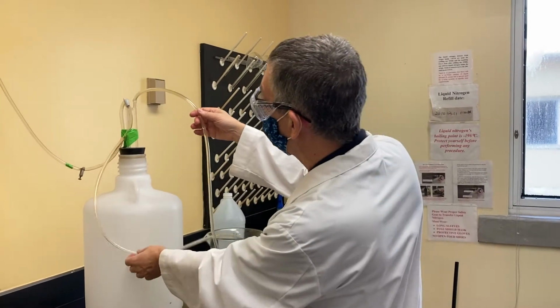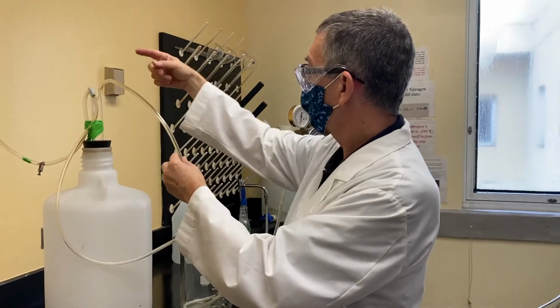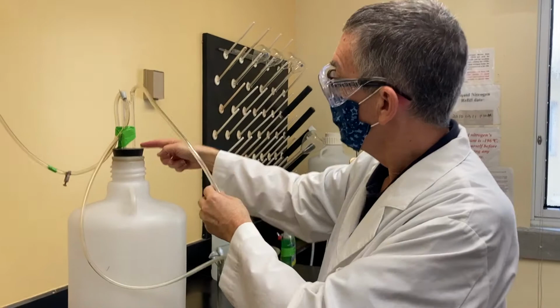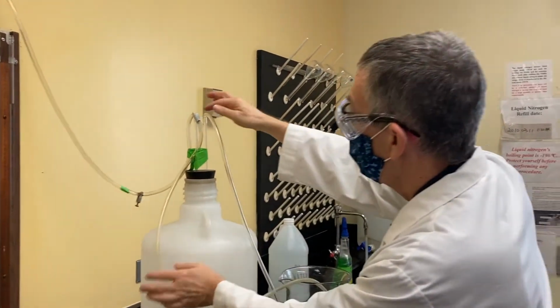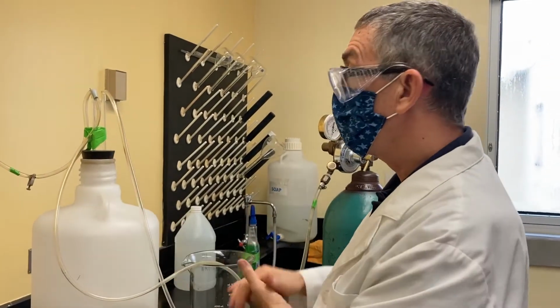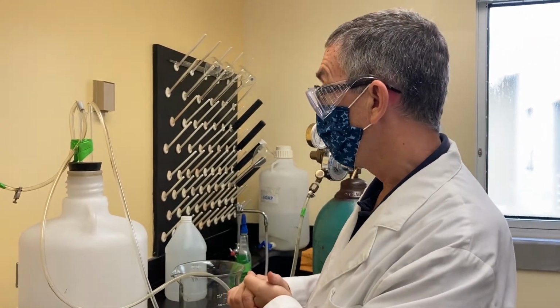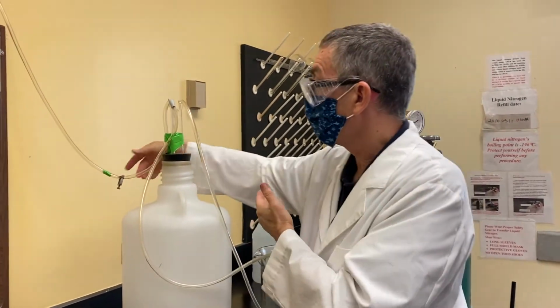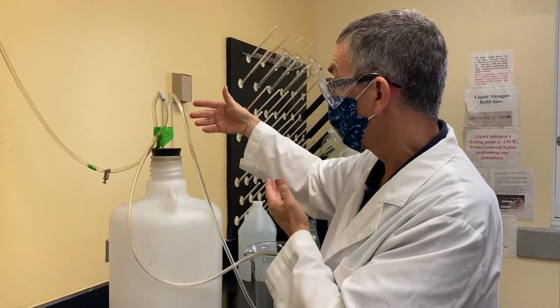Now you notice these three tubes. It's confusing to look at. One goes to the gas tank, so this fills us with argon. One goes to the manometer so we can measure the pressure, and the other one goes to the water. There are clamps, as you can see, so that we can clamp off the different tubes at different points in the experiment. But we will fill this and then we will isolate it, except we'll keep it in contact with the dibutyl phthalate so we can always be measuring the pressure.